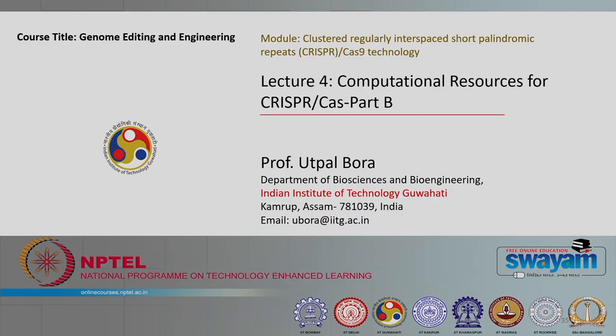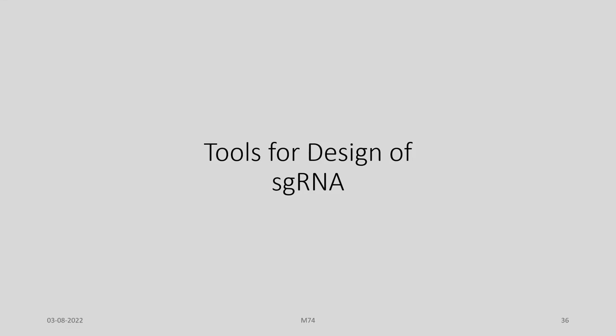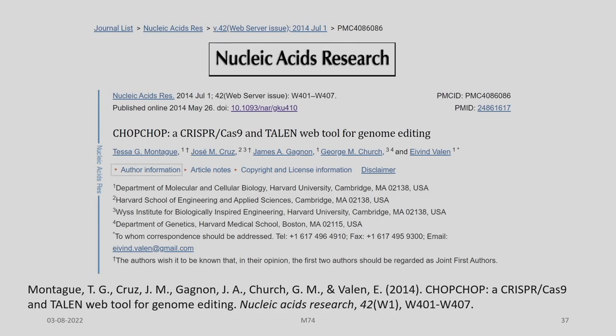Welcome back to my course on Genome Editing and Engineering. We are discussing CRISPR-Cas9 computational resources. Let us look into some of the tools available for design of sgRNA. One of the tools developed by Montague and his colleagues is CHOPCHOP, a CRISPR-Cas9 and TALEN web tool for genome editing.